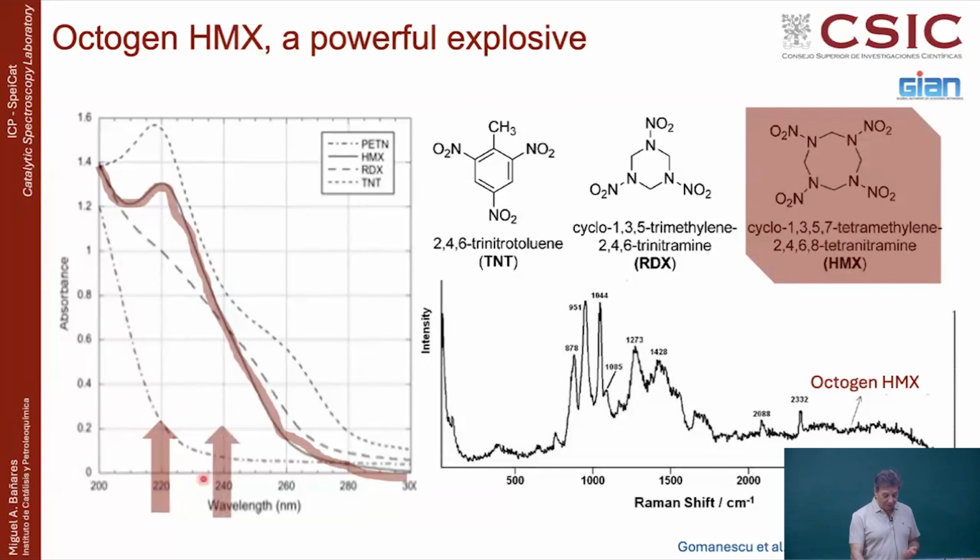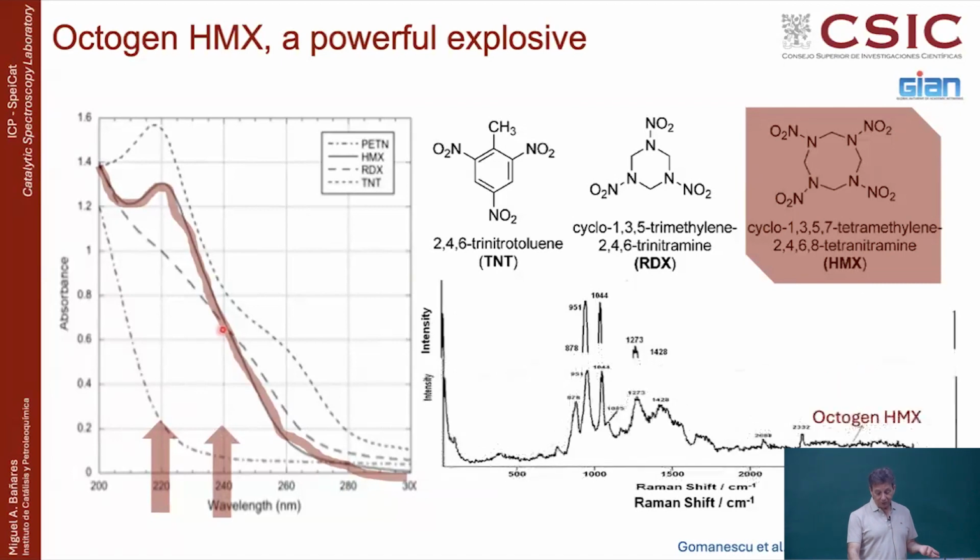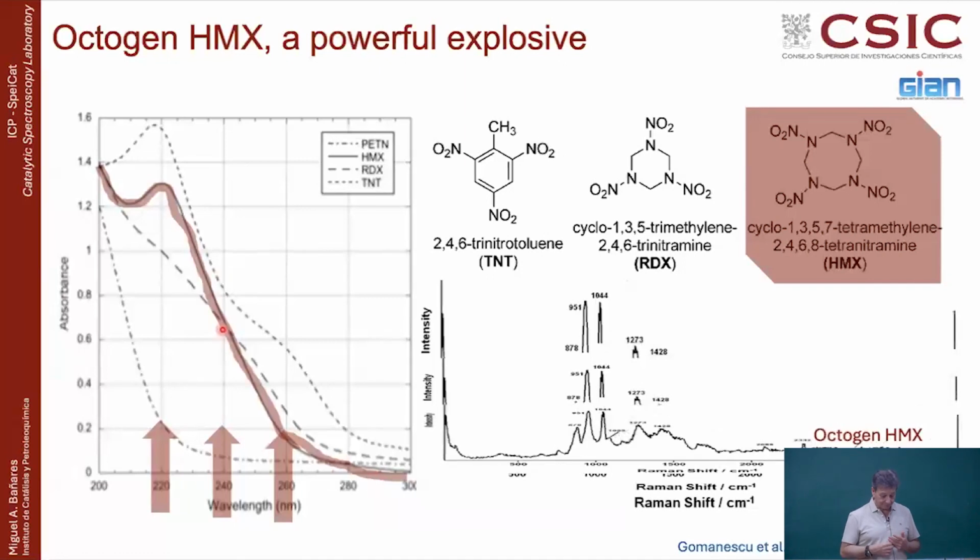If you were going to look at it at 240, okay, the resonance enhancement is no longer that special. You are already near resonance, but not really at resonance, so the spectra for the same concentration will be weaker. And if you stay, like we typically do in most cases, off resonance, you will get whatever you get for this compound.